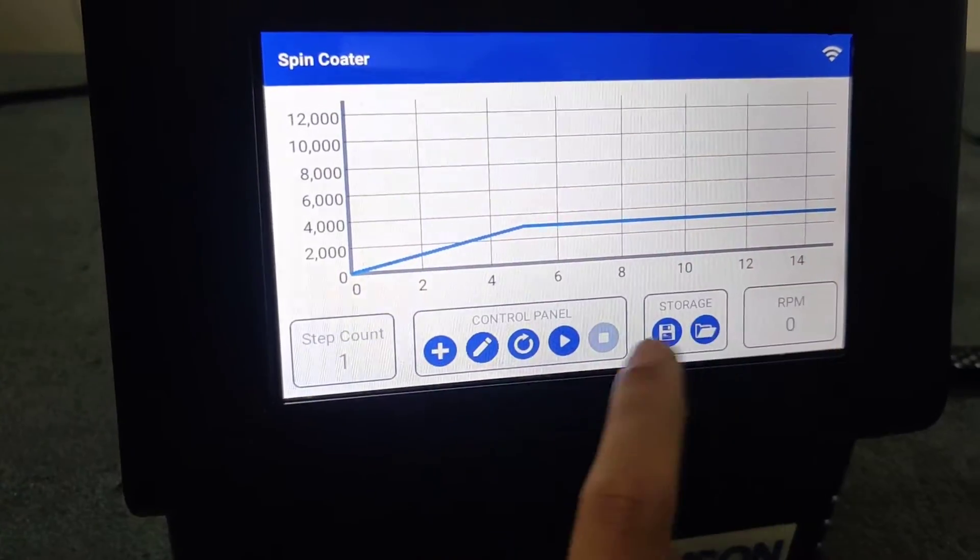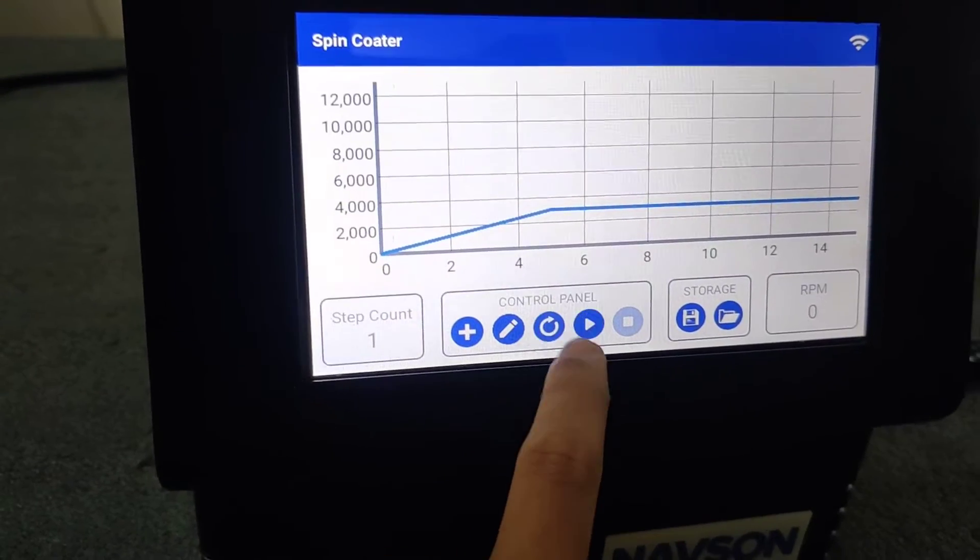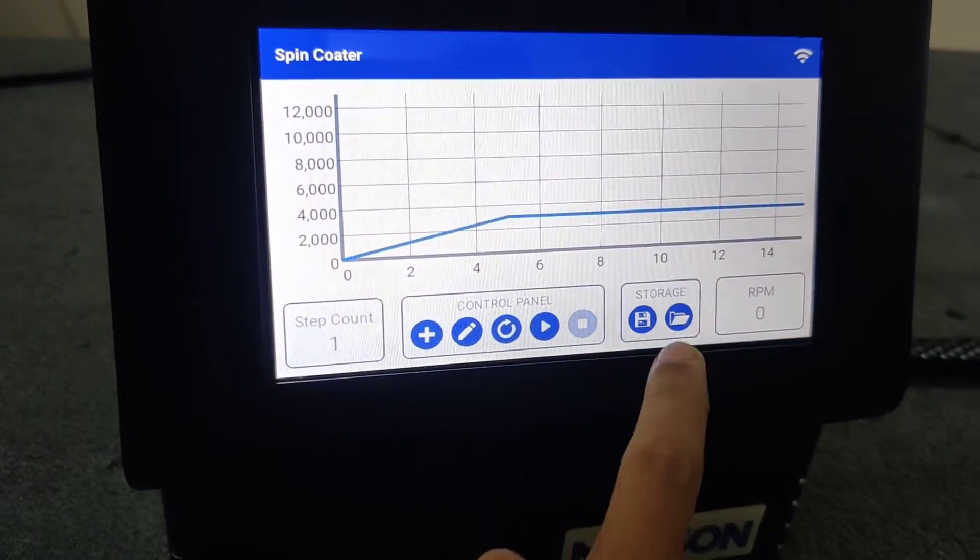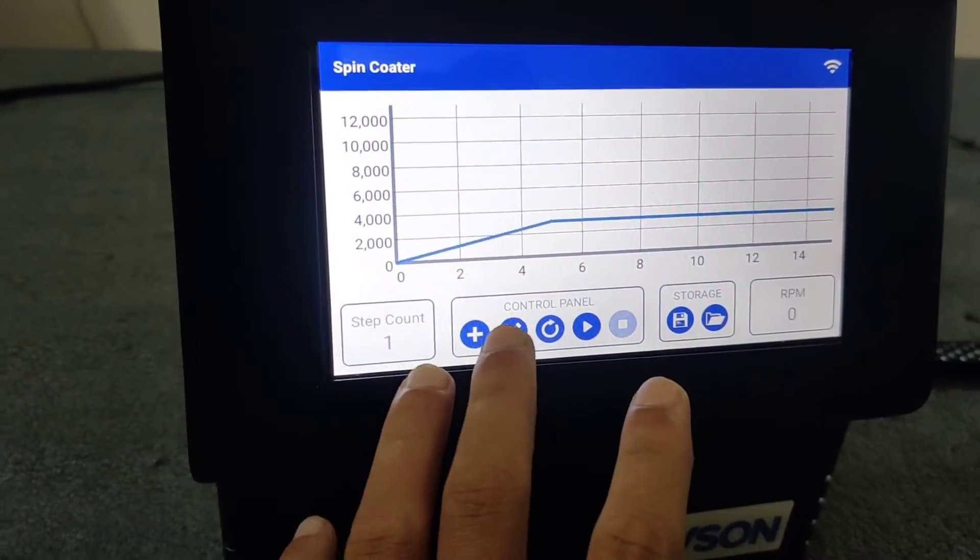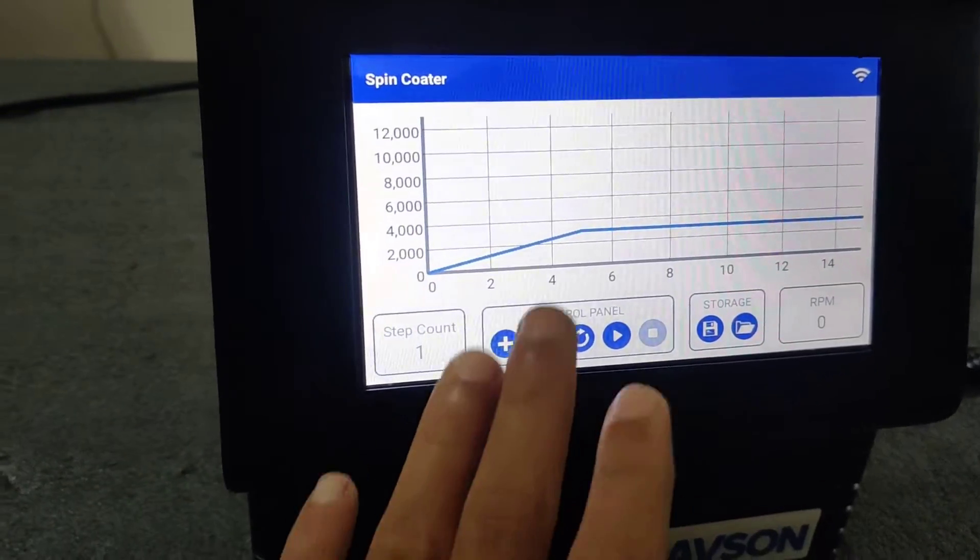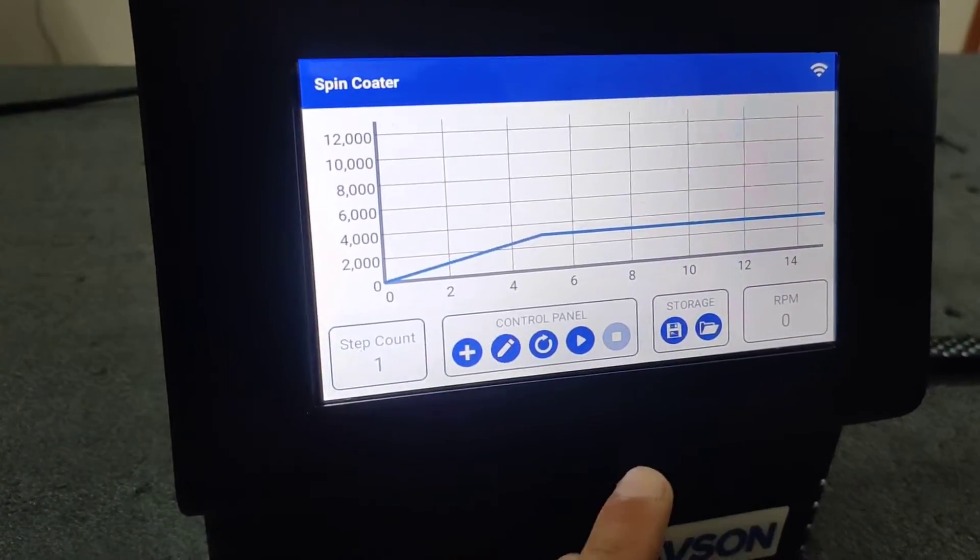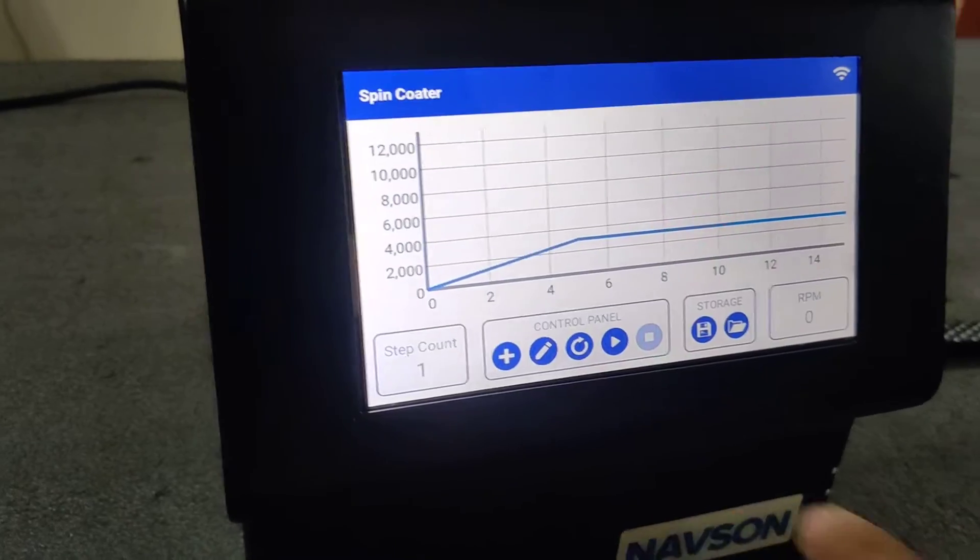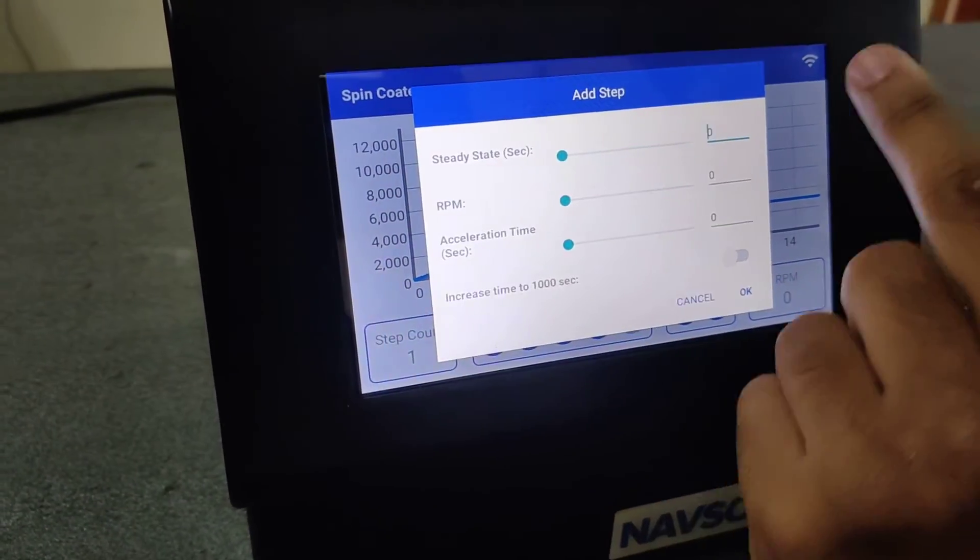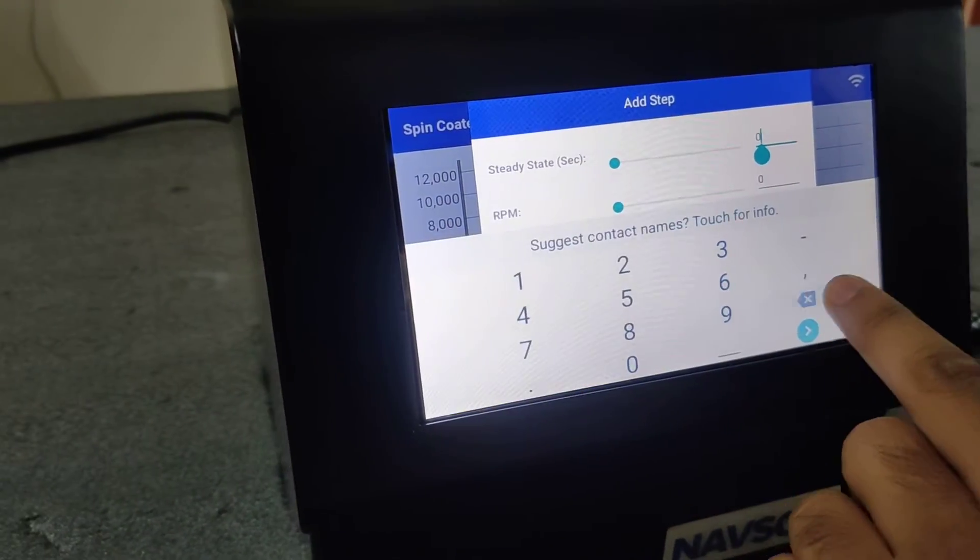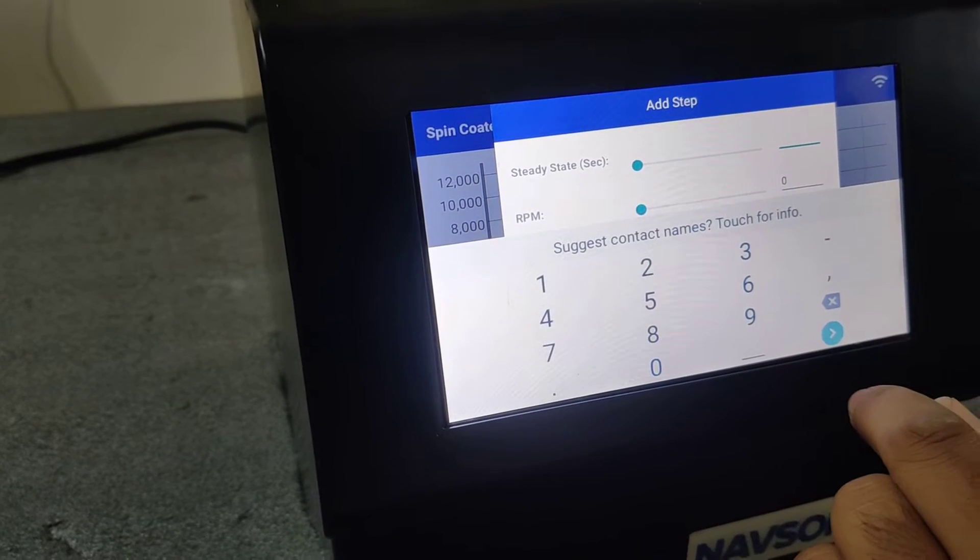Only once you add the graph, you will be able to edit it, refresh it, play it, or save it. Before adding, you can't add any more graphs. If you need to add more steps, again go to plus, add the required steps. Say I need now to ramp up to 6000 RPM.